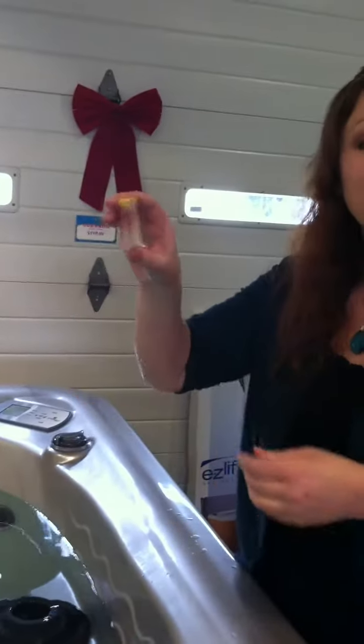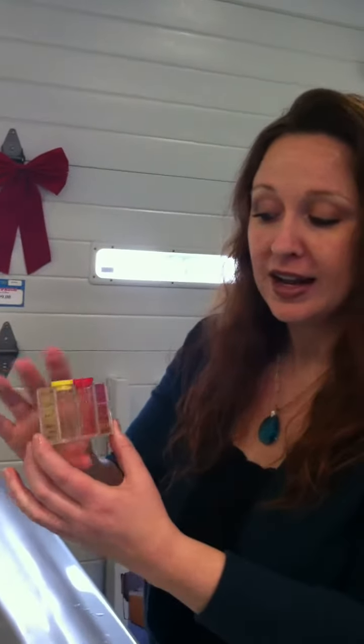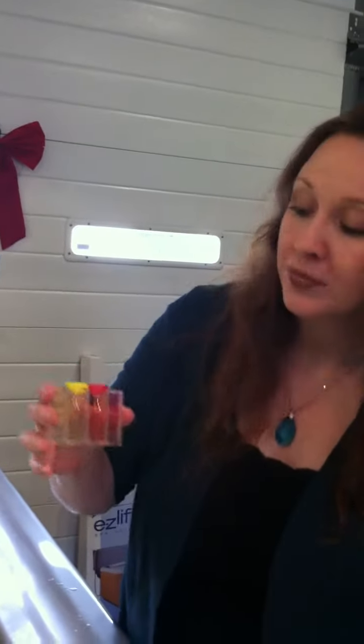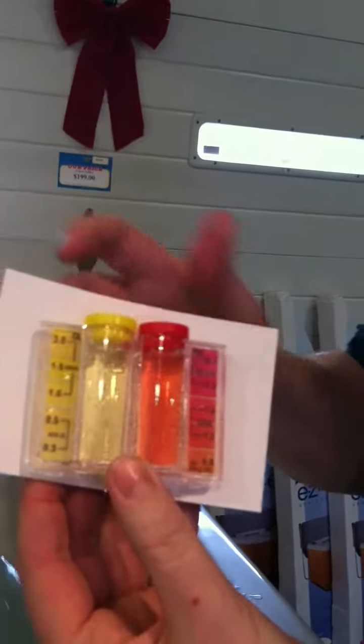Now what you want to do, you don't want to shake your test vial — you just want to simply invert your wrist a couple of times. That gives you an accurate read. No shaking necessary. Then ideally hold your sample up with a white card, white piece of paper, or whatever you may have, so you can see a true read of what your colors are.